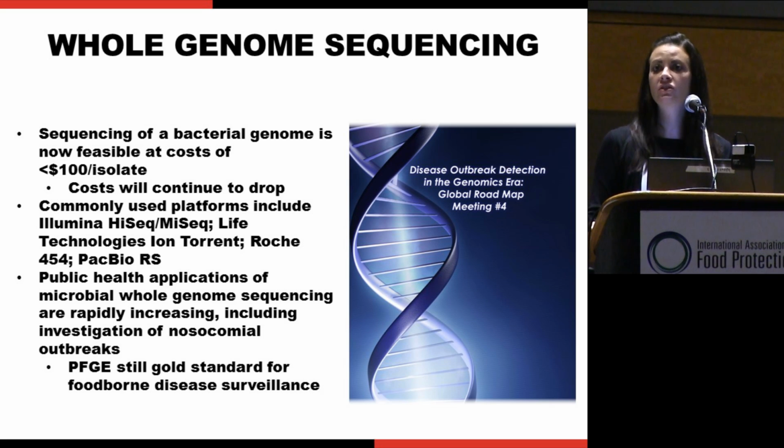Some of the speakers later on this morning will talk more to this, but now it's possible to sequence a bacterial genome for less than $100. Even in my lab, for research purposes, we're quite interested in sequencing Listeria monocytogenes genomes. One of my graduate students was doing library preps to put 30 on the machine, which would cost us less than a couple of $1,000s. So we can really do a lot in terms of being able to sequence genomes at this point.